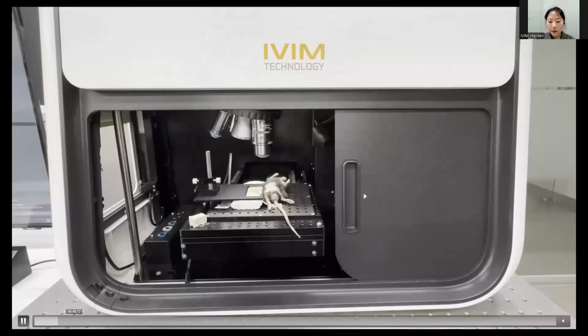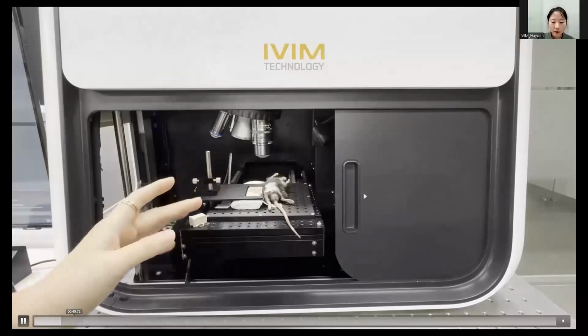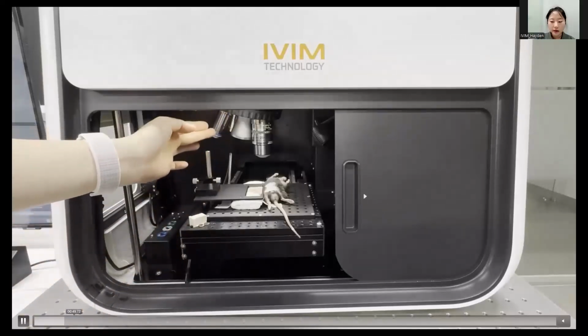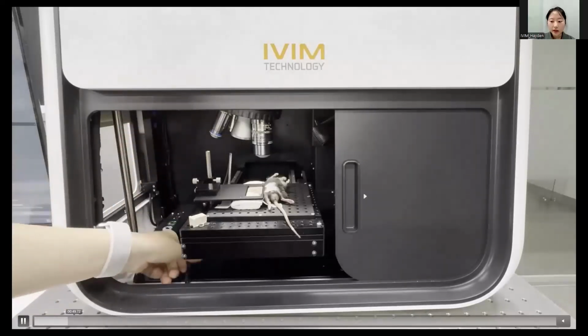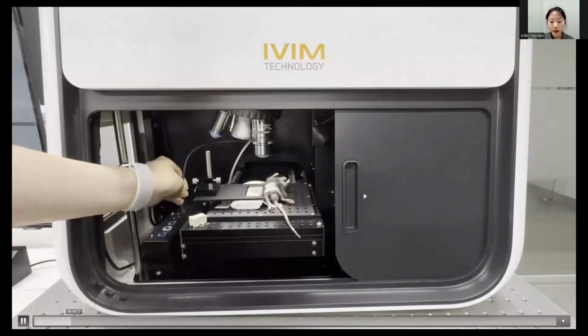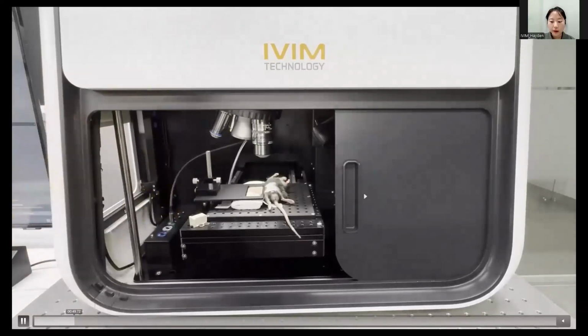Next, I'll explain the main body in more detail. There is a stage where the animal model is placed for the imaging, and on the ceiling there is a turret that can hold up to 5 objective lenses, and next to it there are ports where you can connect up to 5 temperature sensors. For example, if you want to keep the stage warm to maintain the mouse's body temperature, you just need to connect this cable to the port.